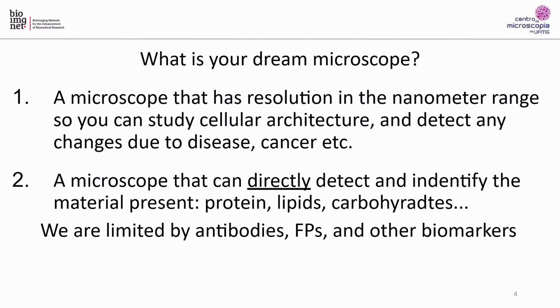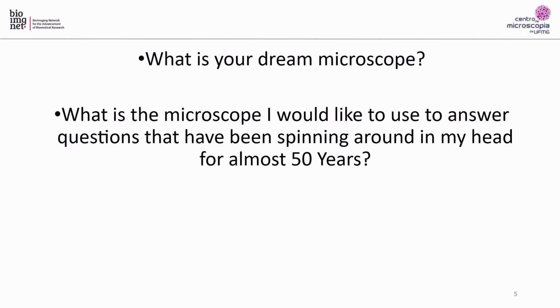But then you also want something that you can directly detect and identify material that's present: proteins, lipids, carbohydrates. We've been hearing that we're limited by antibodies that don't work. Most of you have probably done SDS-PAGE gels, so you know how many bands you have on a gel that are unknown. And you sit there like, okay, what are these things that are important? These things have been running around in my mind.